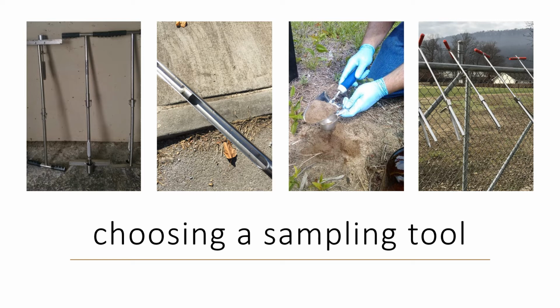Clay soils and damp soils can also present challenges depending on the type of sample device that's used. For this reason, again, it's recommended that a pilot test should be conducted ahead of full-scale sampling at a site, if possible, to ensure that the sample tool is appropriate for site conditions.